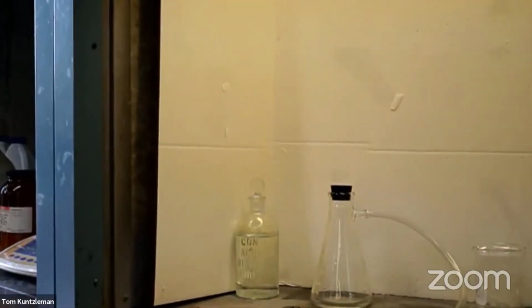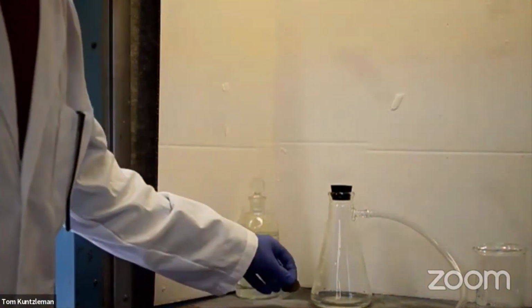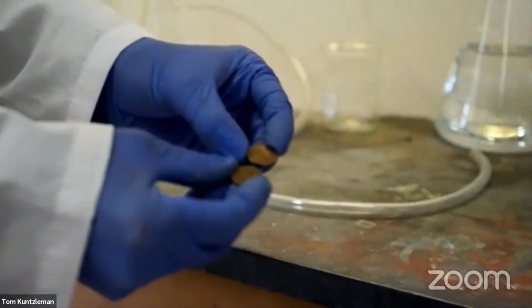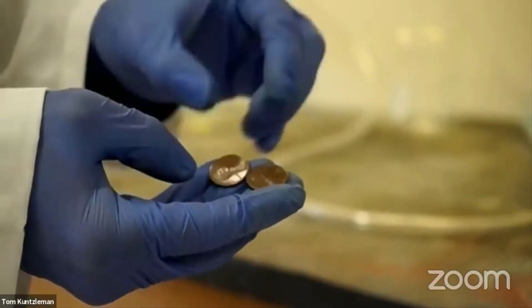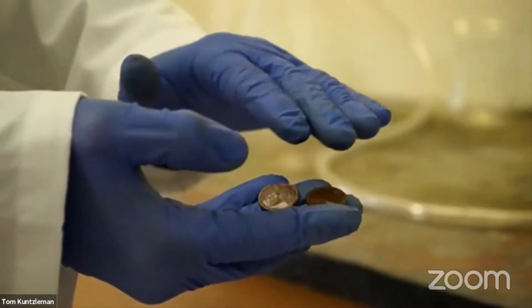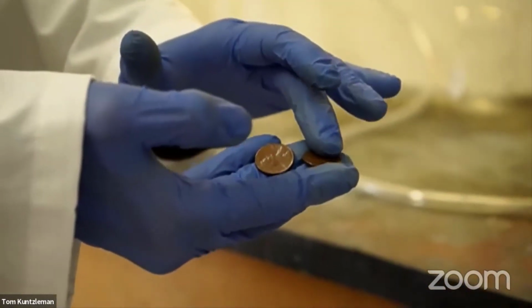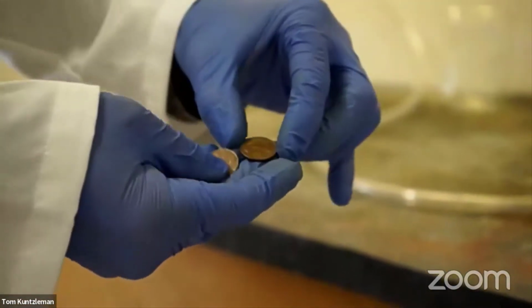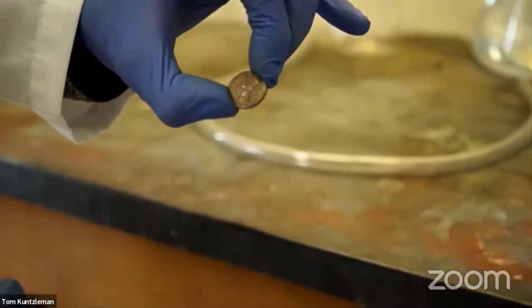I think the first experiment we'll do, I'm going to take some of these little pennies that I have here, and we're gonna put it in some acid. So what we're going to see in this case, these are old pennies. They're made of copper, and so what we're going to see is what happens if we take the copper metal and actually turn it into a compound. The acid is going to react with this chemically, and it's going to change it from the metal form into something else. And we want to see what's going to go on there.